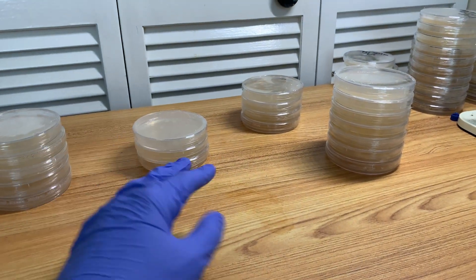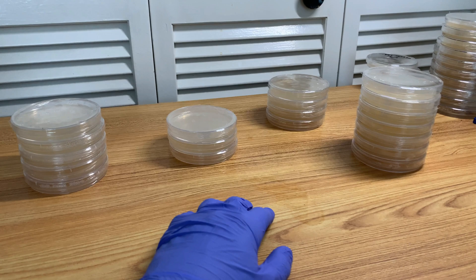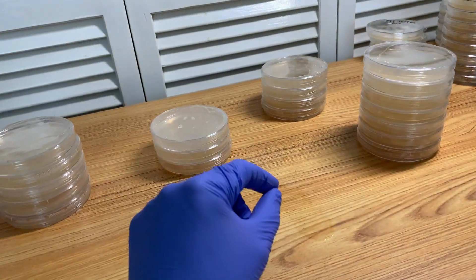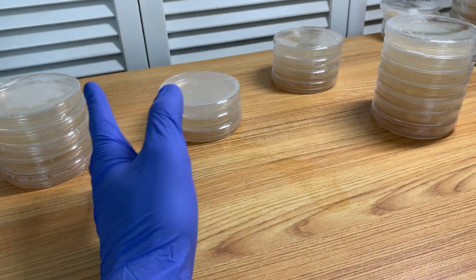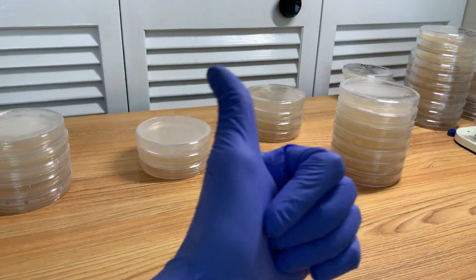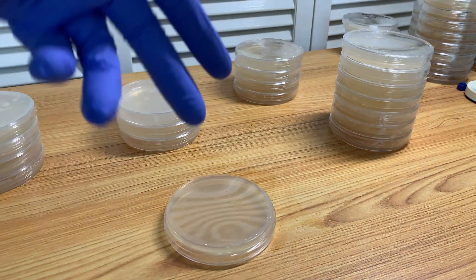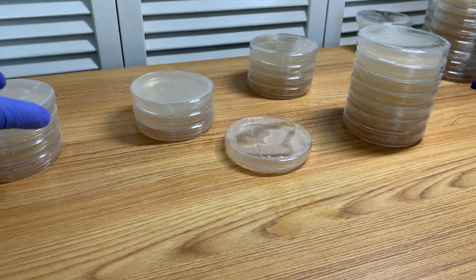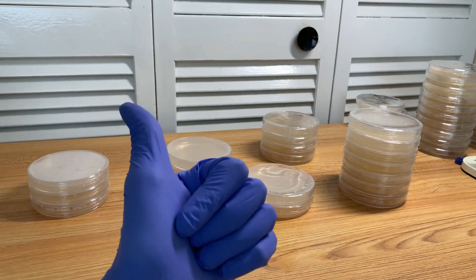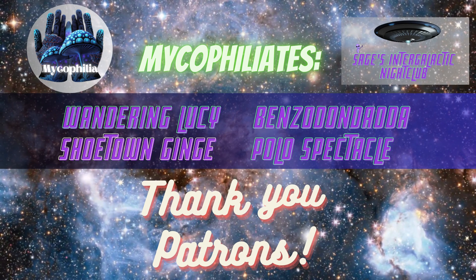These plates are ready to be used now. This is way better than I expected, because some of these plates have been inside the sleeve for around a year — the oldest ones at least. I was worried because I'm handling them more and wrapping them twice before use, increasing contamination vectors, but thankfully no issues. What really helped was spraying each one down with hypochlorous acid — or alcohol if that's what you use — one spray front, one spray back, directly into the SAB. So here is ecological mycology tips, episode one. I'll see you guys more in this series — hope you have a great day or night. Bye-bye!